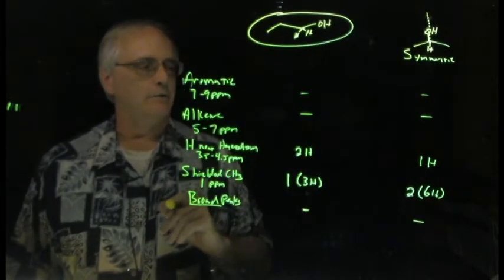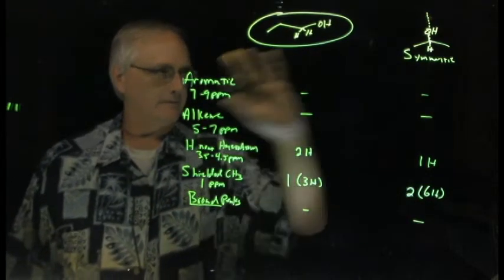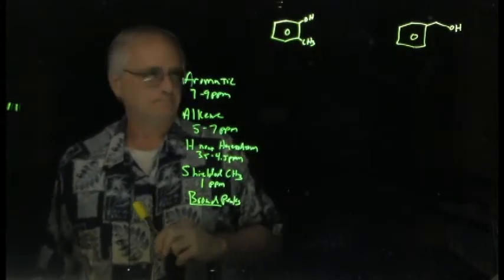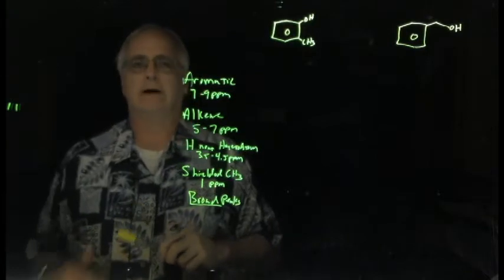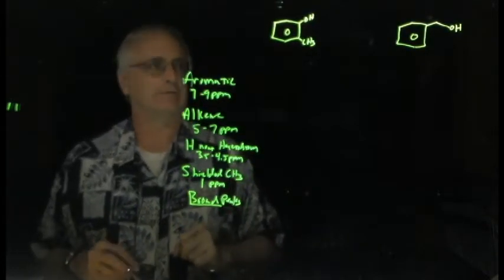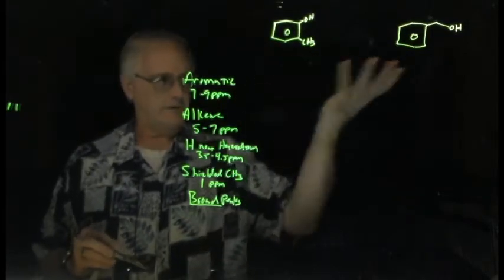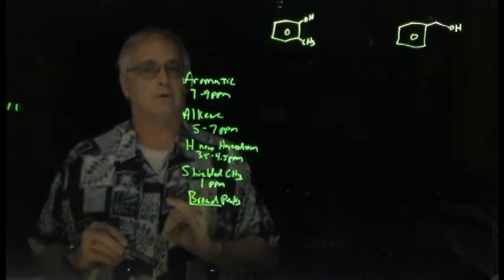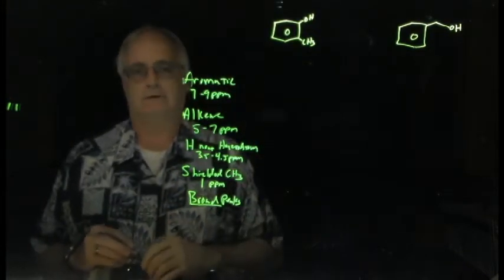Now what I'm going to do is move on to problem 2. We're going to leave our 5 best friends up here, reset the molecules. Be right back. Here's problem 2. Okay, these 2 molecules are closely related to each other, but ever so slightly different. So again, we are going to examine these 2 structures in light of our 5 best friends, picking out what we need to look for when we actually see the spectrum to be able to tell if it's this molecule or that molecule.